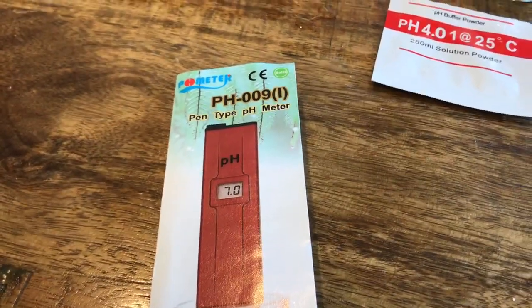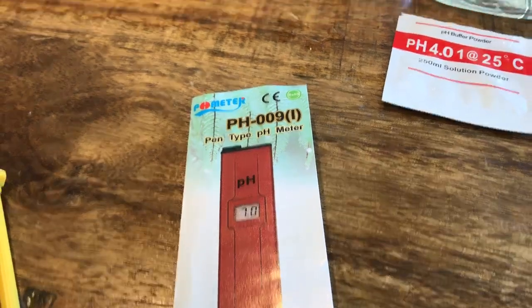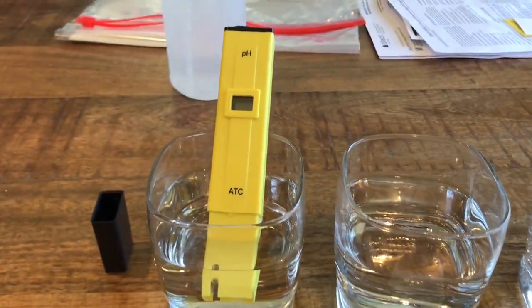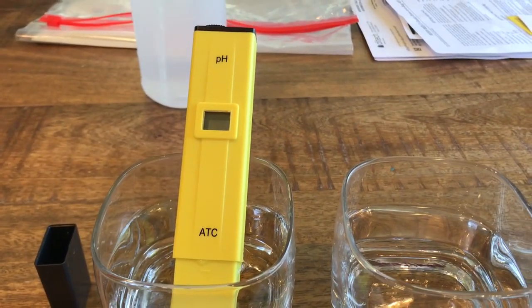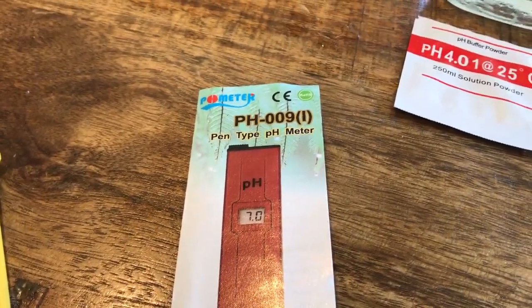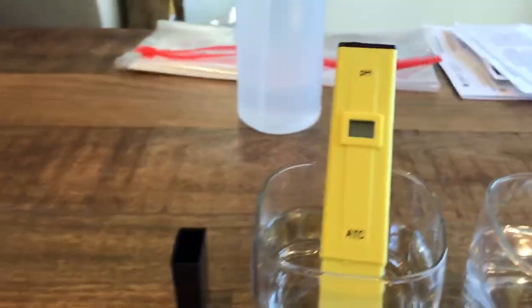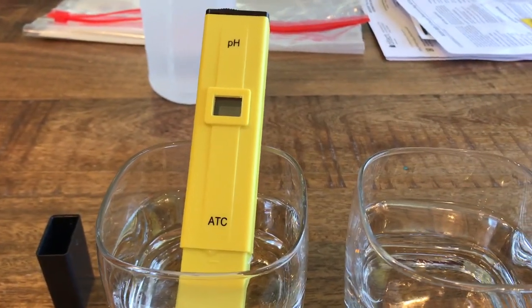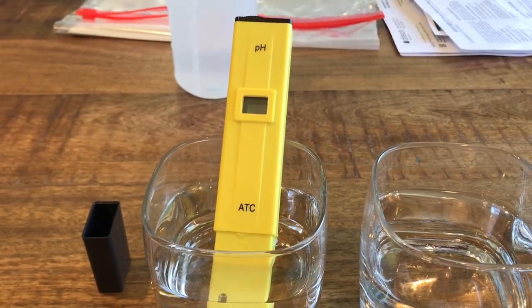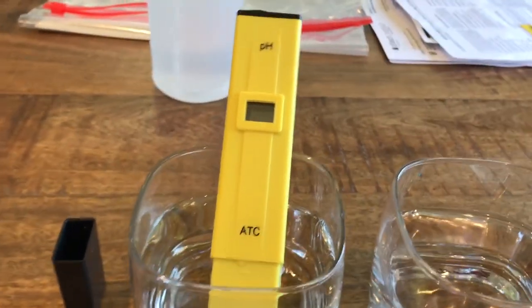Hello everyone, Dave here. I just wanted to give a quick video on one of these Chinese ATC pH meters — the pH 009 pen-type pH meter. I bought one of these because I was trying to step up from pH papers and brew some beer.